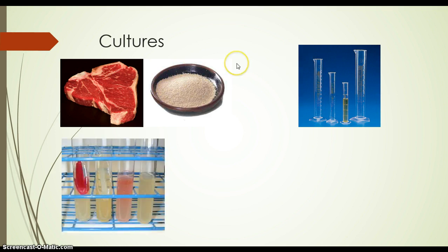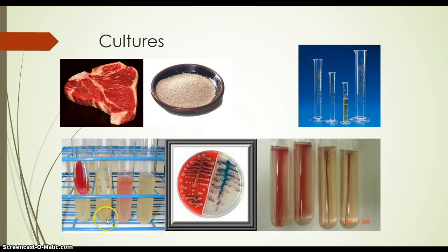Another way to look at something is, like y'all have seen already, you can look at slants, broths, a plate, and then a deep. Sorry, brain fart. The good thing about slants is that they have a very thick level of nutrients right here, but also have the surface area to grow a good number.